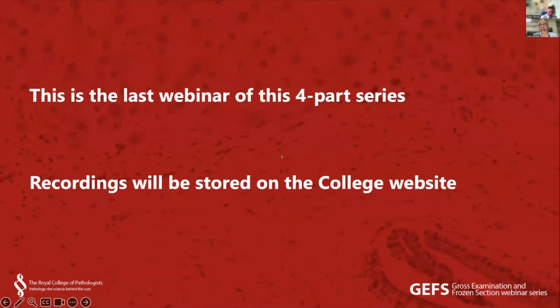It's a little bit like trying to determine whether a tumor deposit anywhere else is within a node. If you think you can see a lymph node structure, then you can call it an omental lymph node. But again, in my experience, a lot of the time, you can't see anything. If you can't see a convincing lymph node structure, I think you just have to call it an omental tumour deposit. Clearly that's going to be much more likely in someone that's already got a pT4A primary tumour with peritoneal surface involvement. So I would apply the same principles as I would to tumour deposits that are closer to the primary tumour. Okay, right.